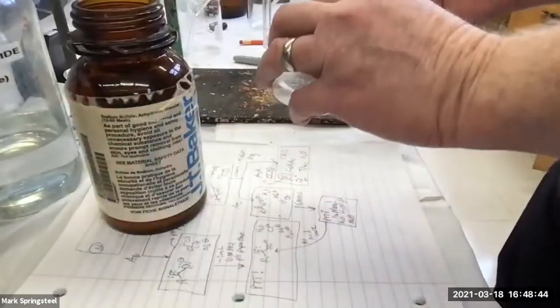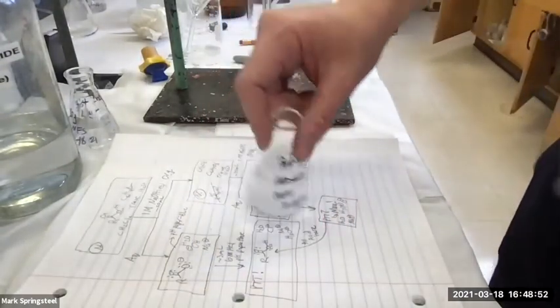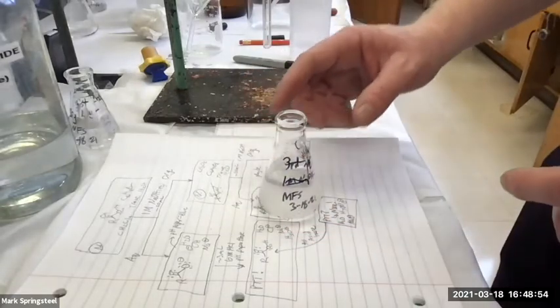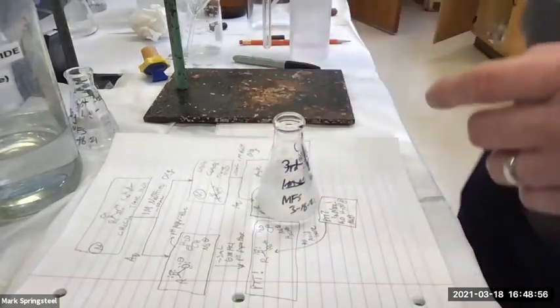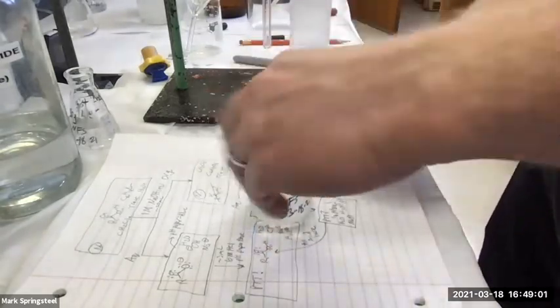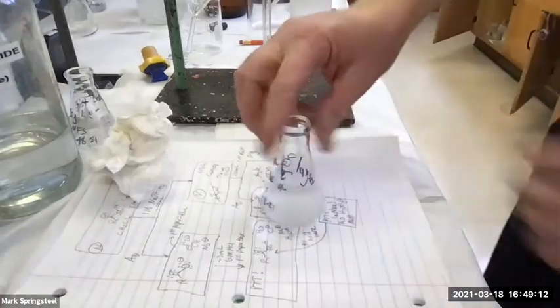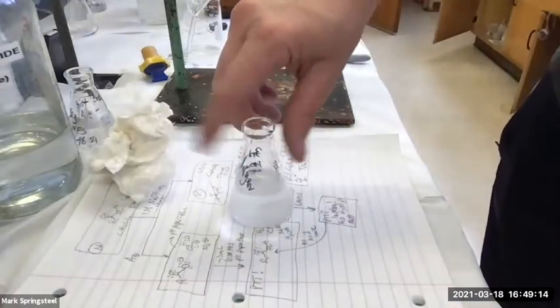And then after I do this, if I want to be very good about this and do it properly, not the most proper, I could cork this and let it sit for like 10, 15 minutes. Sometimes you'll actually swirl some out. Sometimes you'll let it sit till the next lab period. This would be a good pausing point if you're running out of lab time. But I'm going to go ahead and decant it.